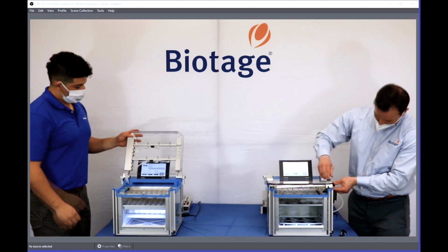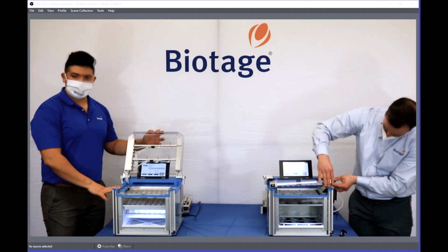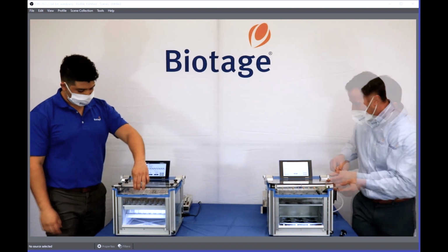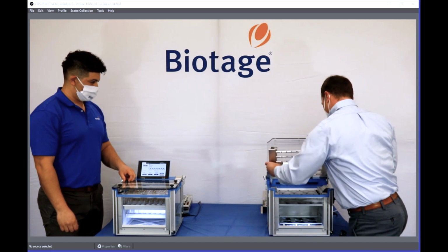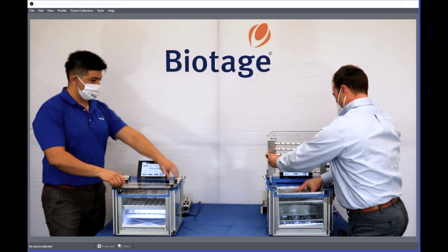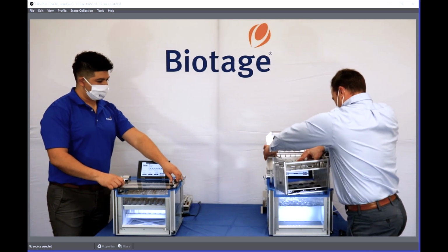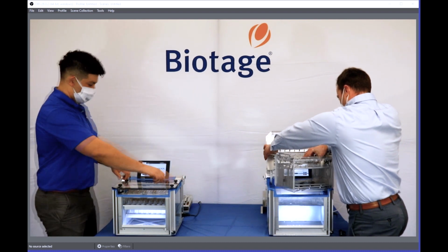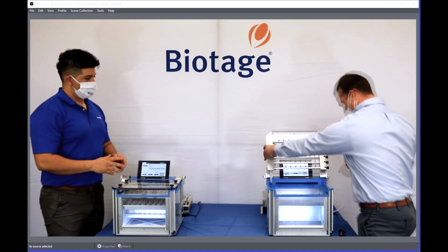Put us on the spot, but we could do it. Our LV system is a TurboVap 2 over here. Take out. All right. Do you want some help? No, I have it. I'm just taking out my pack because it's a different setup.